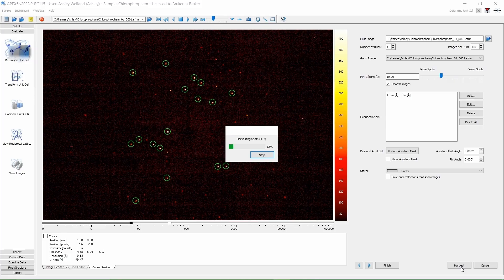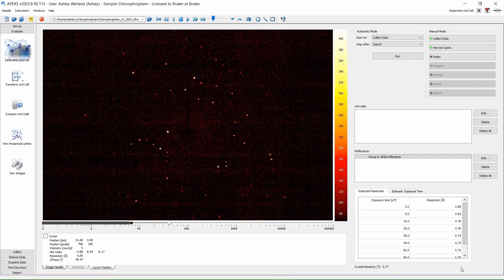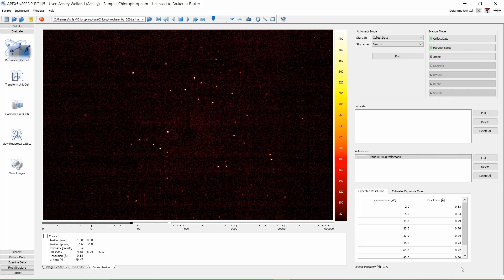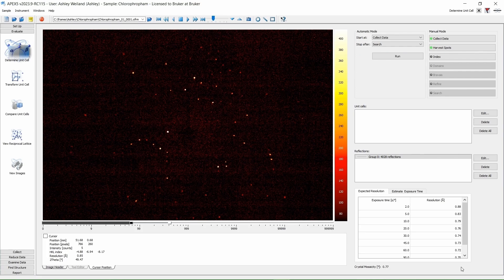Click Harvest. This is compiling all the reflections that have a signal-to-noise ratio larger than the value we put in that box. Here we have over 4000 reflections. This is a very large number. I am usually happy with any number larger than 80.